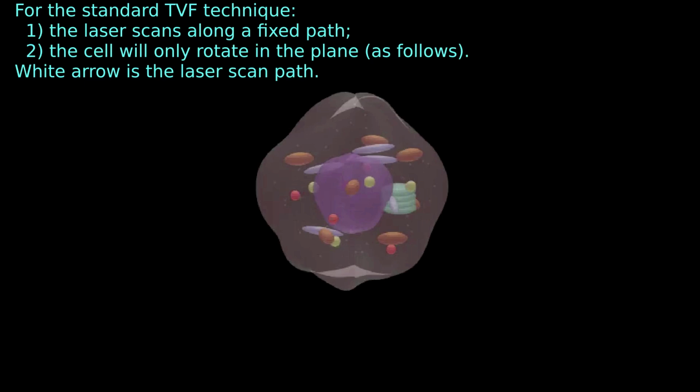Now, the problem with the standard TVF technique is that the cell will rotate only in the plane. What follows is a short simulation to show the method.